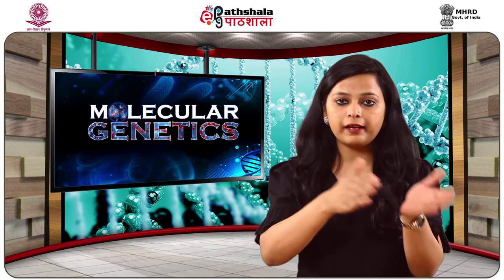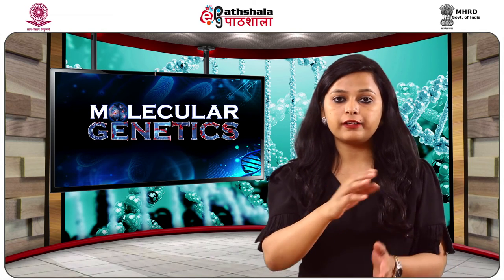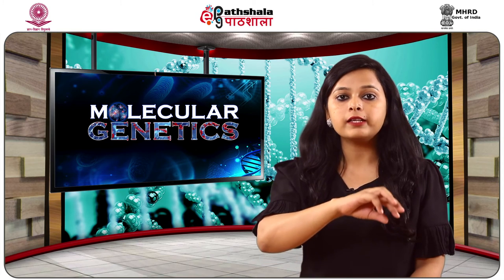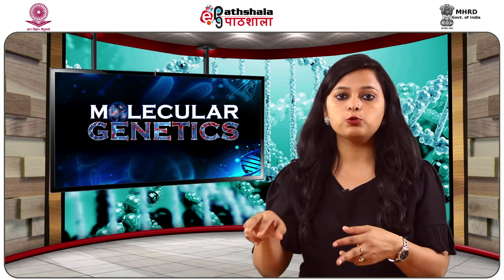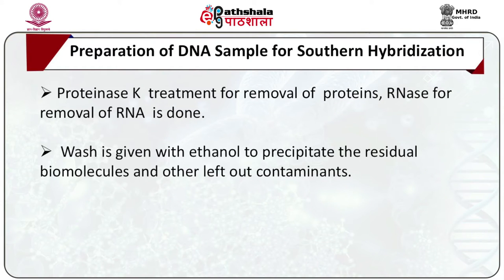Once the cells are lysed, various biomolecules present inside the cell other than the DNA are removed using different treatments like proteinase K for removing proteins, RNase for RNA, and so on. Lastly, a final wash is given with ethanol to precipitate the DNA and remove residual contaminants.